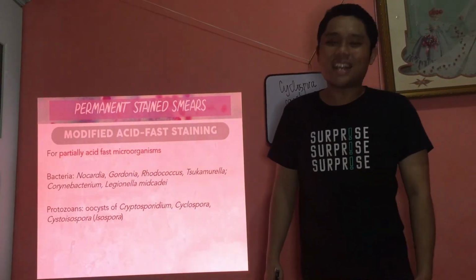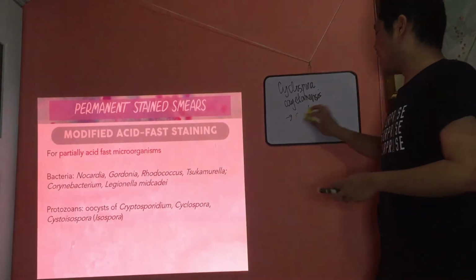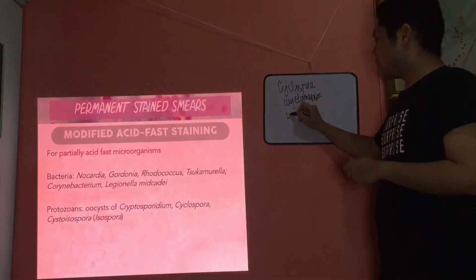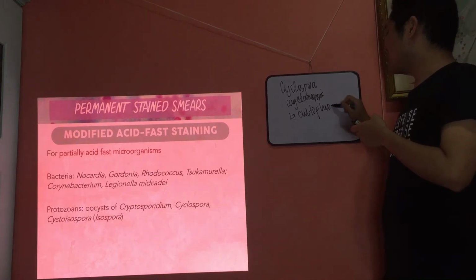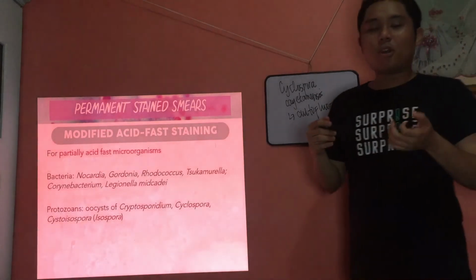Lahat ng mga pinag-aaralan nyo, it's all real. Okay? Alright. Another characteristic of Cyclospora cayetanensis na lumabas din sa boards is that it exhibits autofluorescence. Dami ko na mga recall questions na sinasabi. Autofluorescence. Ayan, please take note. What do you mean by autofluorescence?